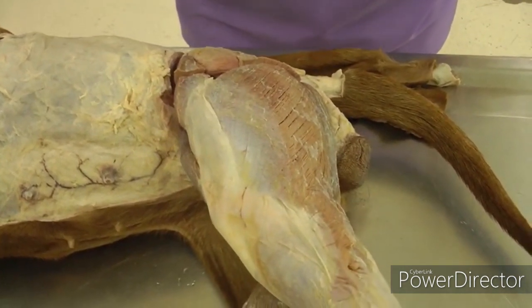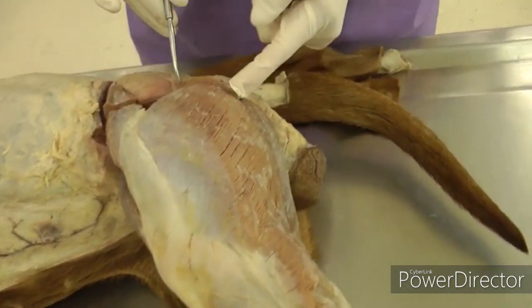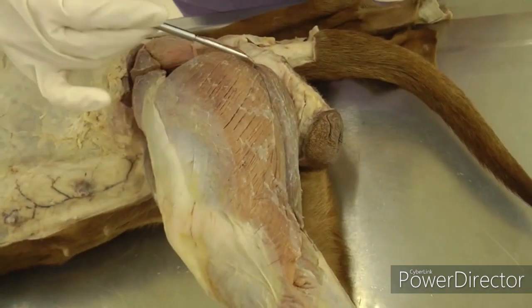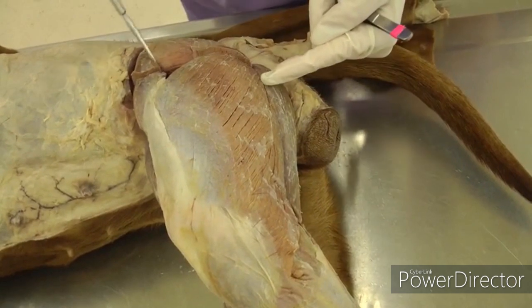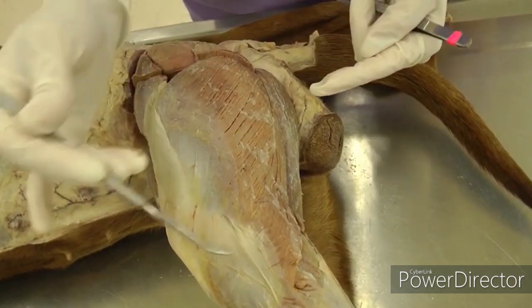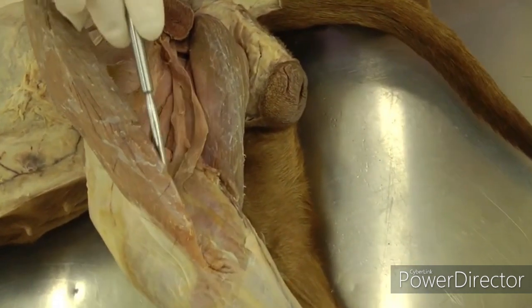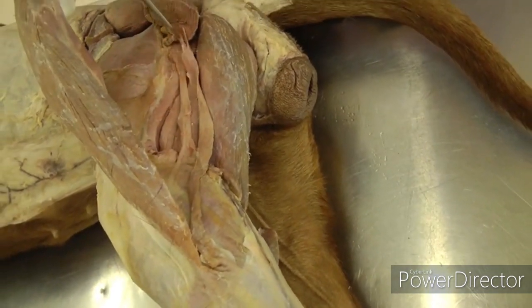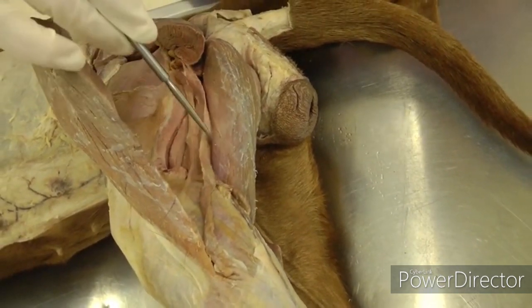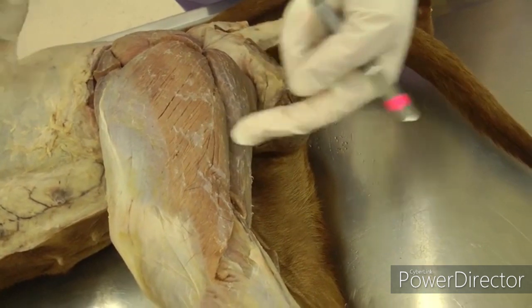We'll start on the muscles. Outline your biceps femoris — the biggest muscle on the lateral side. Define the borders, take off the fat and fascia. Along the caudal edge there is also a tiny little muscle called the caudal crural abductor muscle. It's very small and easily ripped; you can just take it with the biceps when you transect it — that's fine.